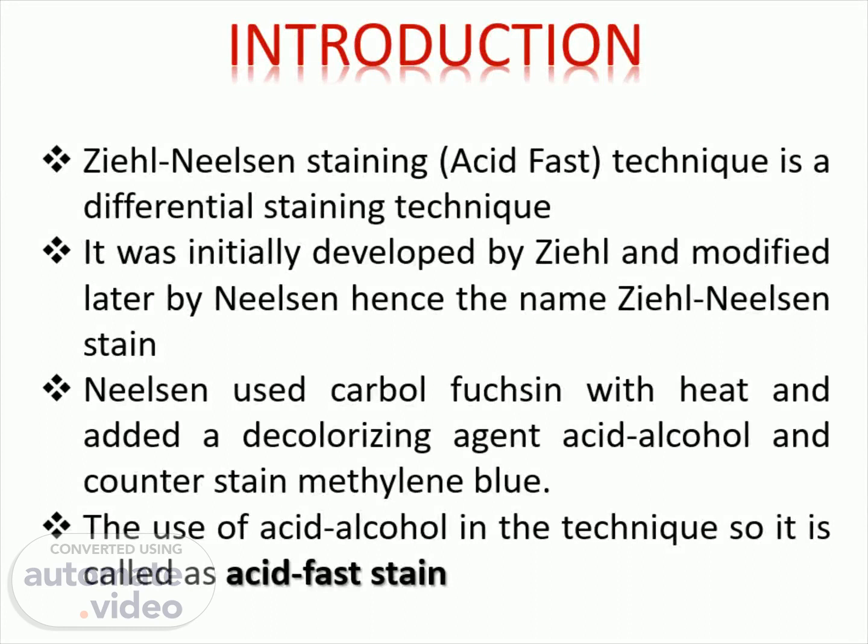Ziehl-Neelsen staining, the acid-fast technique, is a differential staining technique. It was initially developed by Ziehl and modified later by Neelsen, hence the name Ziehl-Neelsen stain. Neelsen used carbol fuchsin with heat and added a decolorizing agent, acid alcohol, and counterstain methylene blue. The use of acid alcohol in the technique is why it is called an acid-fast stain.